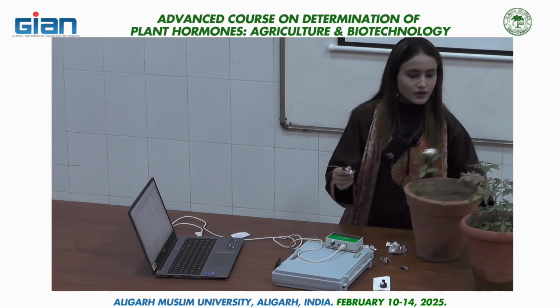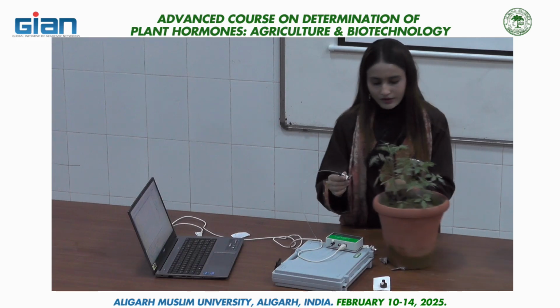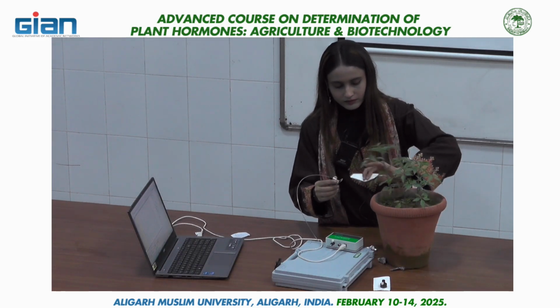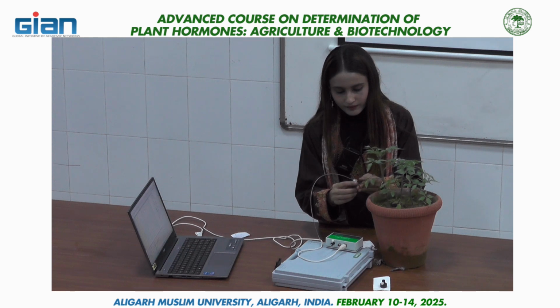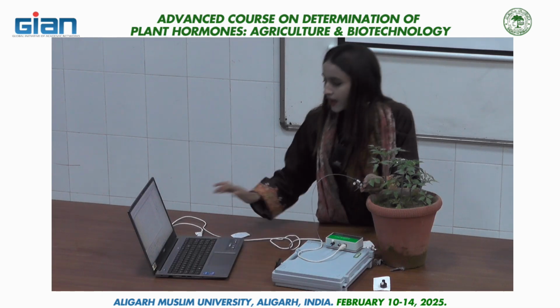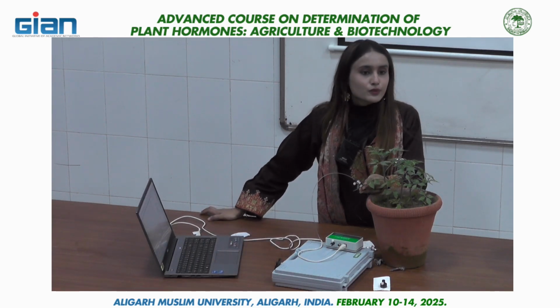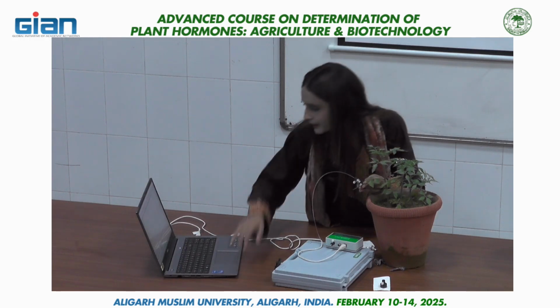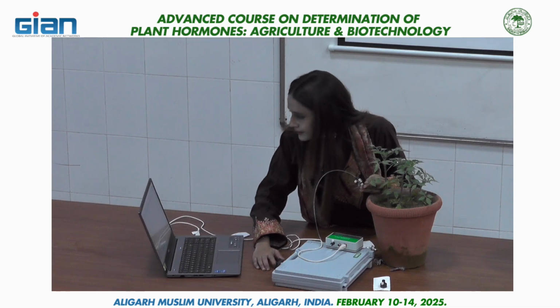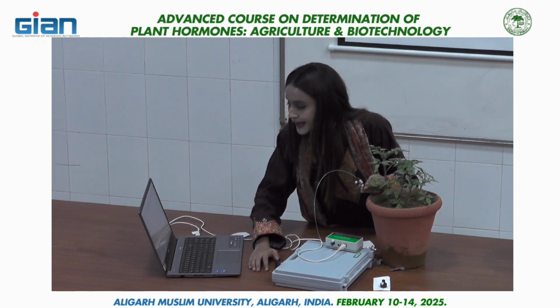Now, if we talk about the control set, then in the control set we are getting an Fv/Fm reading of 0.632. Again, 0.632 is lower than the hormone treated plant. Apart from that, NPQ is 0.013, maximum yield Y is 0.500, and QN is 0.021.